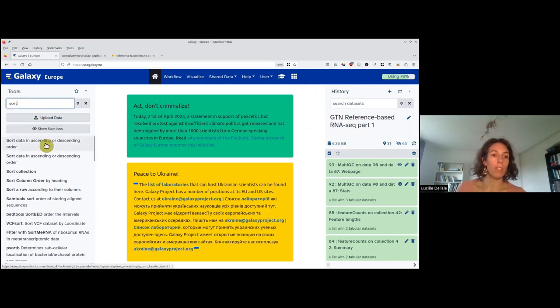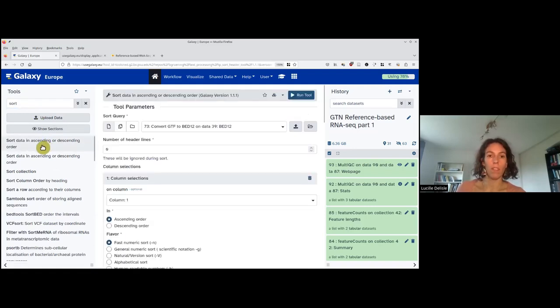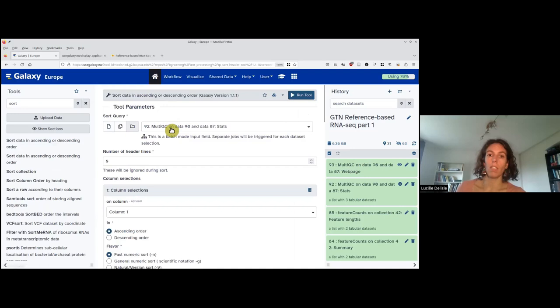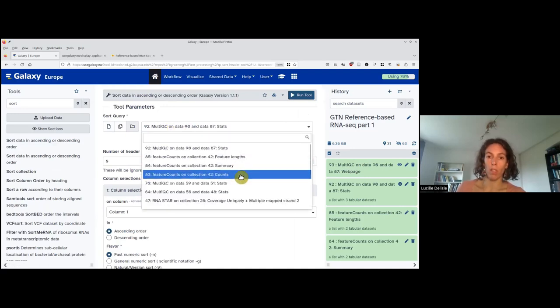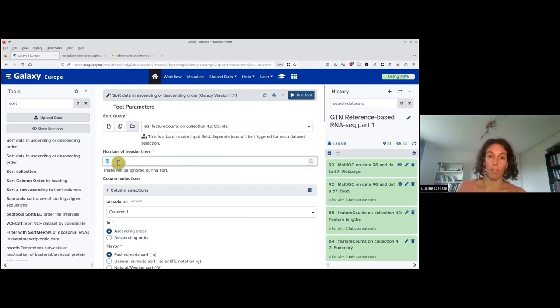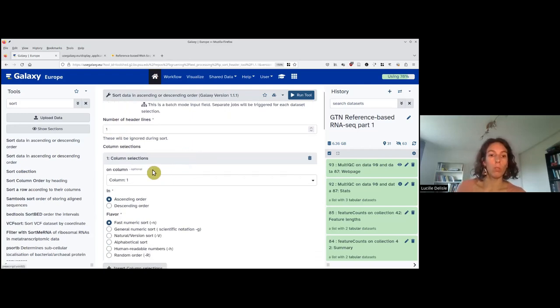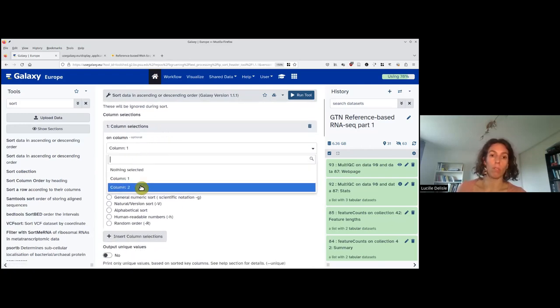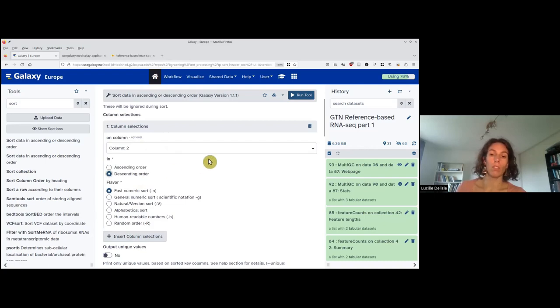On the left panel, we click on 'sort data.' We want to use the collection. If you followed feature counts, you have the counts file. For the number of header lines, if you use feature counts you have one header line; if you use STAR, just put zero. What we want to sort is column two in descending order, so the highest number will be on top.